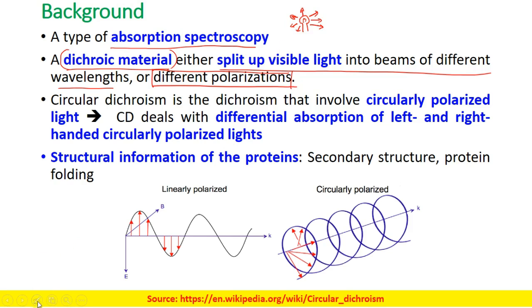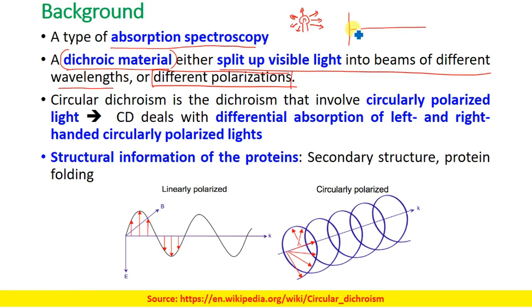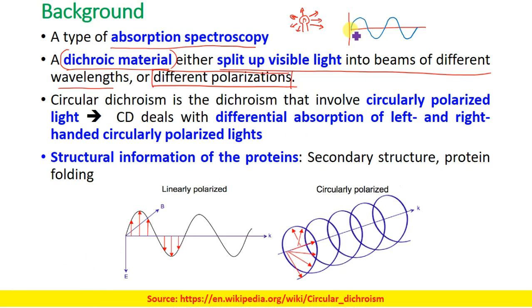Now, we all know that light waves are transverse waves. What are transverse waves? Which travel perpendicular to their direction of motion.